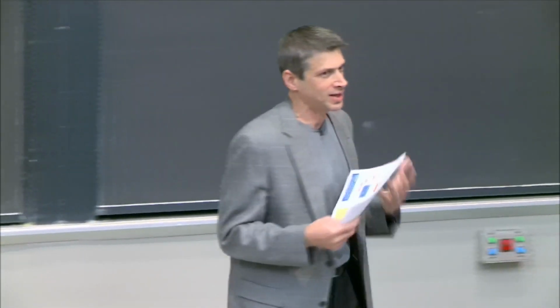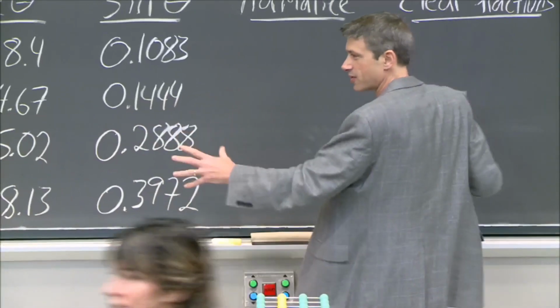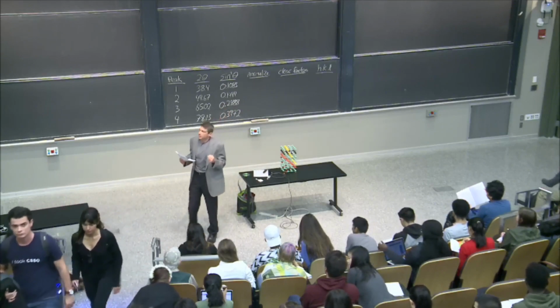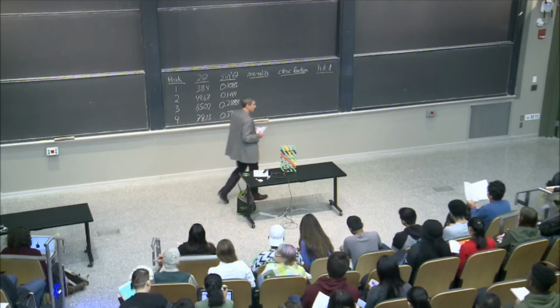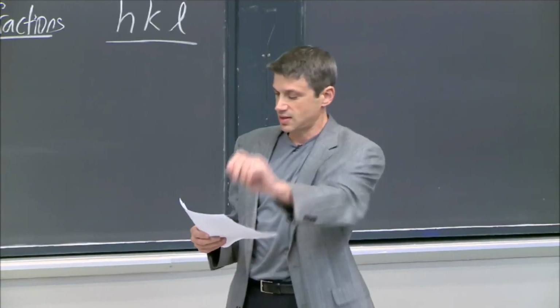We're going to keep talking about XRD today. We're going to pick up where we left off. I filled in some numbers, and then we're going to fill out this chart and really get to a deep understanding of XRD. I'll also talk about Moseley's law and a little bit about another type of XRD that is done.